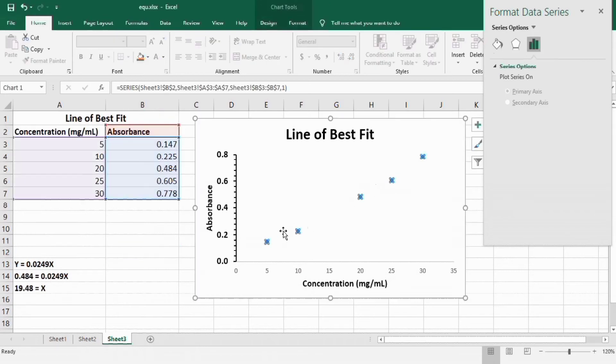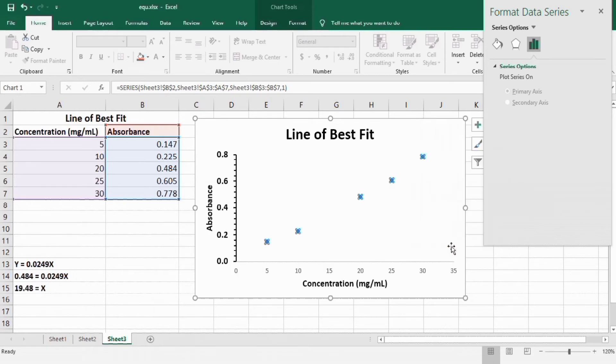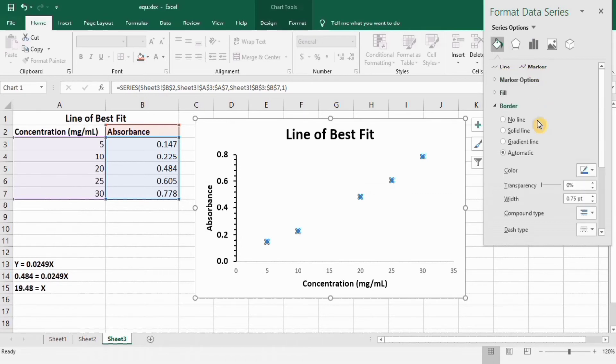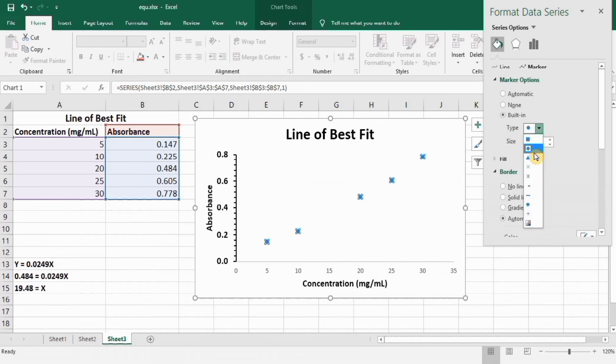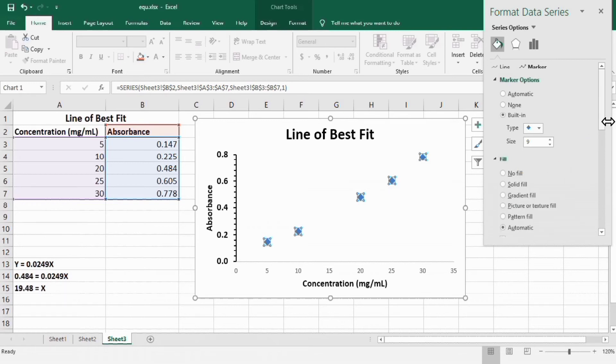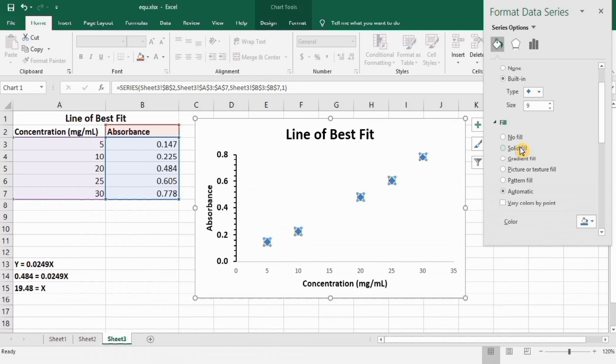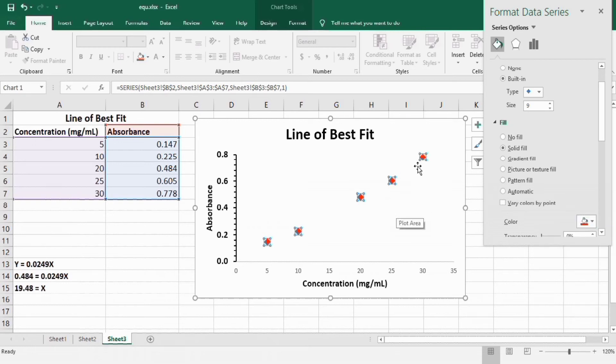Select this marker option. You can see here whole data series is selected. Right click and go to format data series. Go to filler line option and from here you will find the option of marker. Here marker option is available. You can check this built-in option and you can change the marker type. For example I will select this one. You can even change its size. From here you can insert the border around this marker or you can change the fill using this option. For example I want to insert solid fill with red color. You can see here its color is changed.